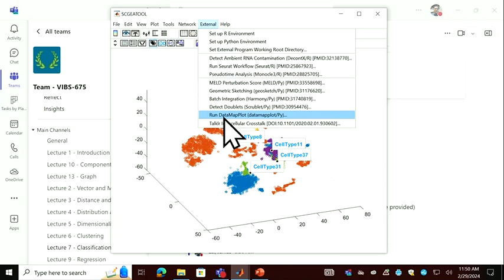So in this menu here, I incorporate several Python-based and also R-based programs. For example, the pseudo-time analysis using Monocle 3 is a very common approach. People try to build a pseudo-time, so I'd rather call this package here, but we have to install it.